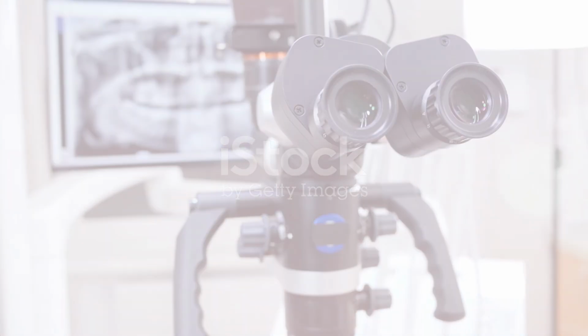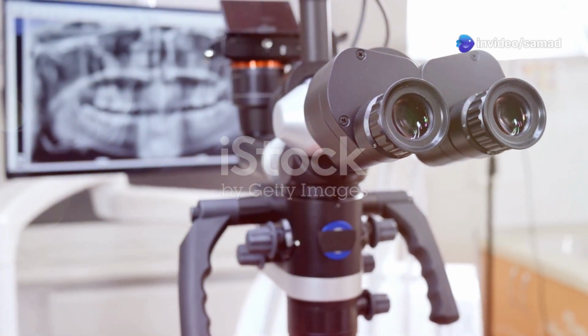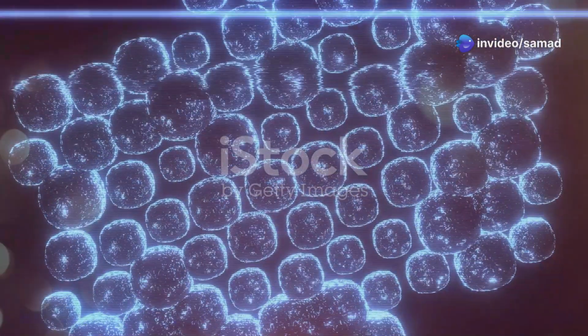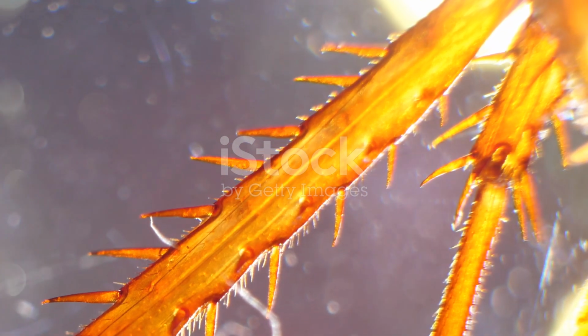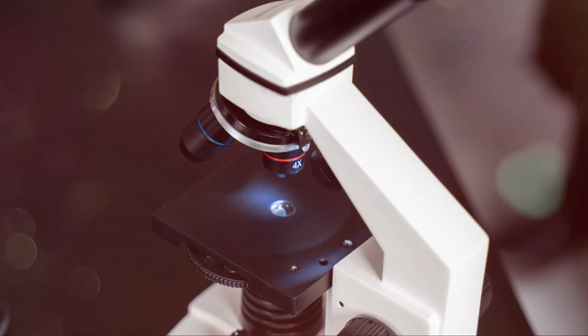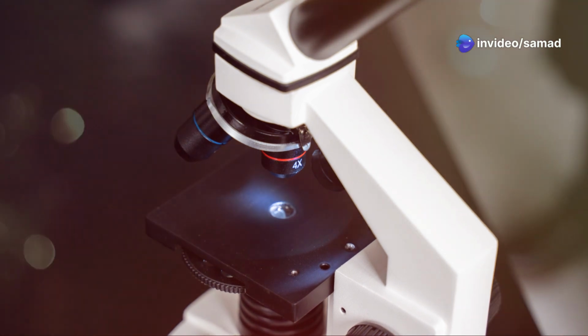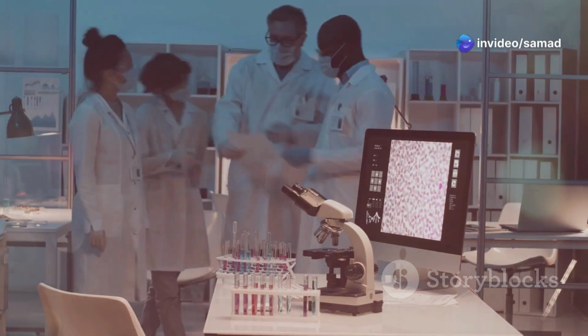To comprehend the power of electron microscopes, we must first understand the concept of resolution. In microscopy, resolution refers to the ability to distinguish between two closely spaced objects. The smaller the details an instrument can resolve, the higher its resolution. Light microscopes, limited by the wavelength of visible light, struggle to resolve objects smaller than 200 nanometers. This limitation arises from the wave nature of light, which causes it to diffract or bend around small objects, blurring the image. Electron microscopes overcome this limitation by utilizing a beam of electrons instead of light.